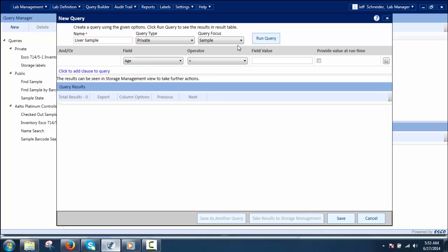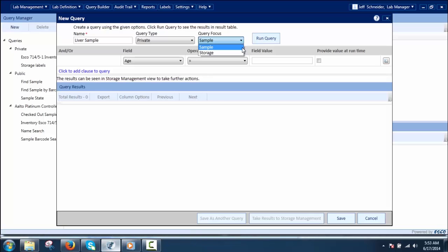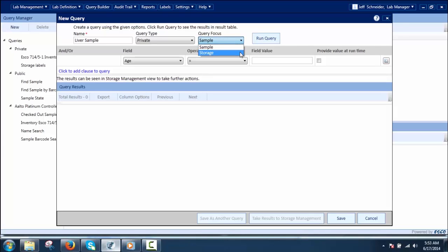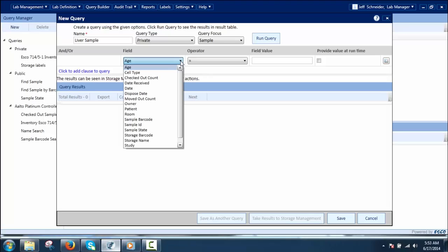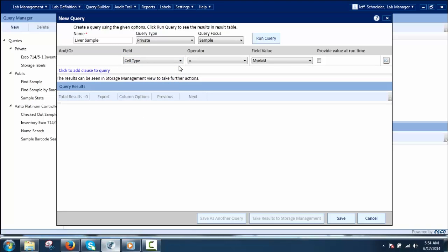Next, select the query focus, which can be based on sample or storage. Depending on the selection, the fields will be displayed in the Query Clause Definer — sample fields for sample focus, and storage fields for storage focus. Then select the field, operator, and field value, and choose AND or OR clause. The fields are derived from the sample definition for sample focus queries.